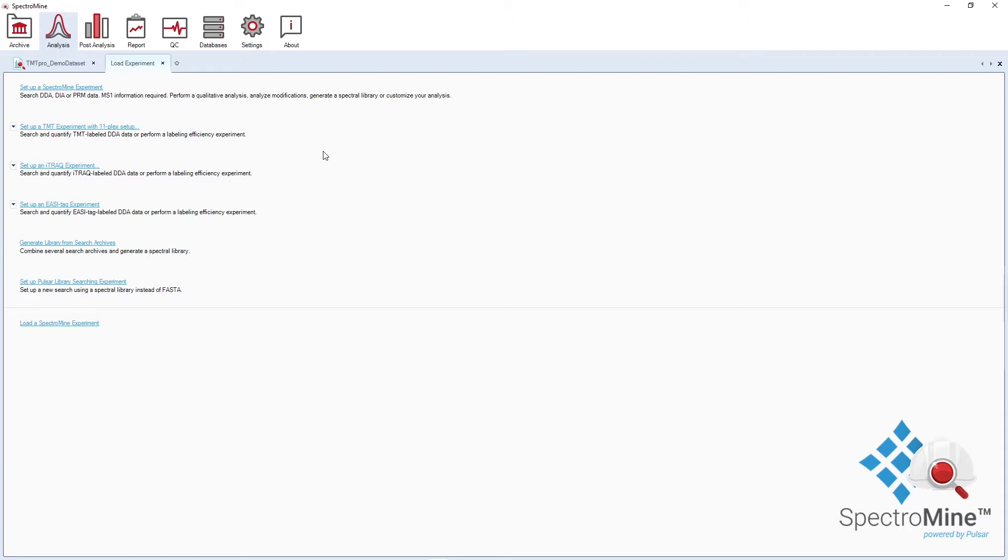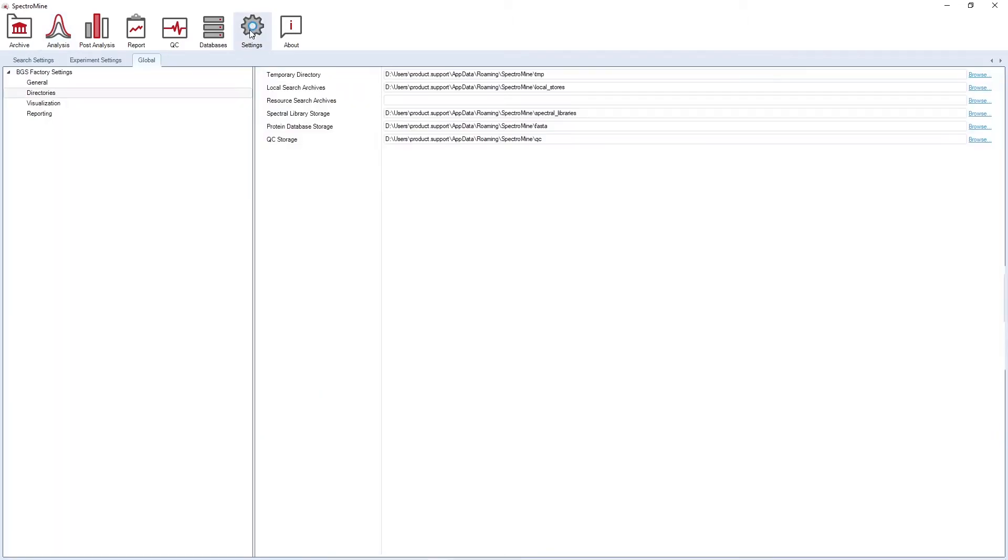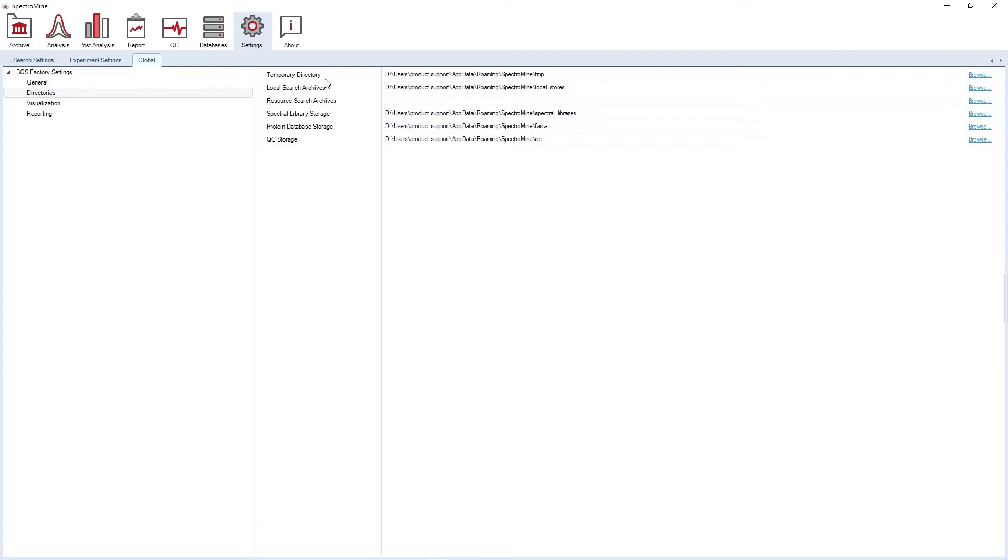Before setting up your analysis, I would like to have a look at the pre-installation recommendations. Under global settings, you have a look at the directories. We recommend setting the temporary directory as well as the local search archives to local destinations with enough storage space. We also recommend running SpectrumMine locally, namely having your resource files, your run files, your local search archives saved on a local drive.